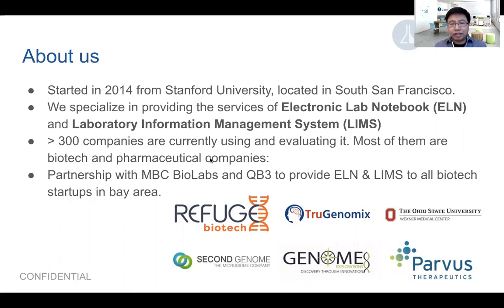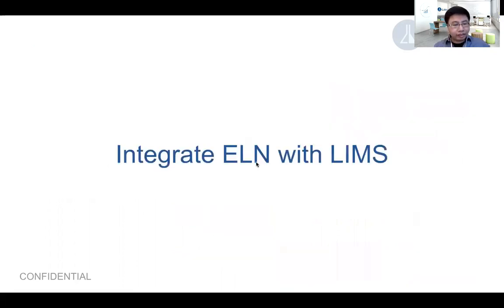Most of our customers are pharmaceutical companies and middle-sized companies. What we did is that we changed our platform a little bit: we integrated the ELN and the LIMS together into one same platform.